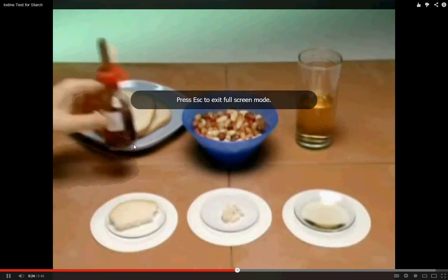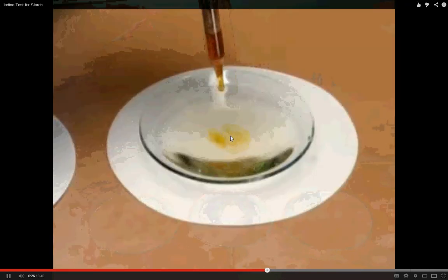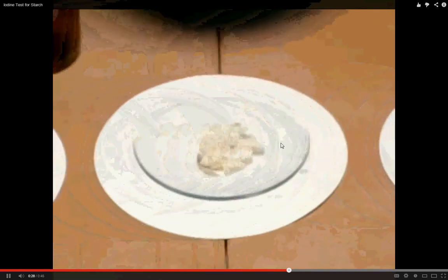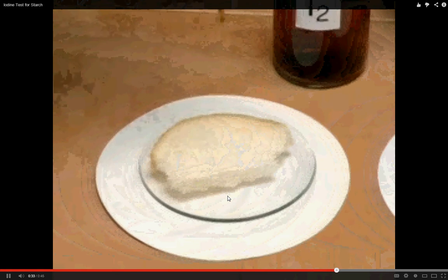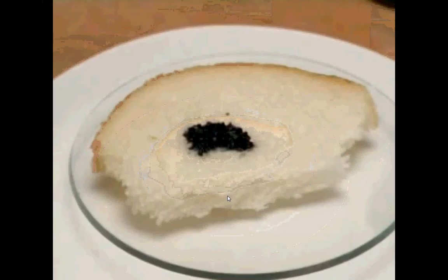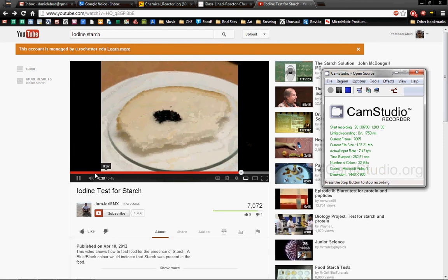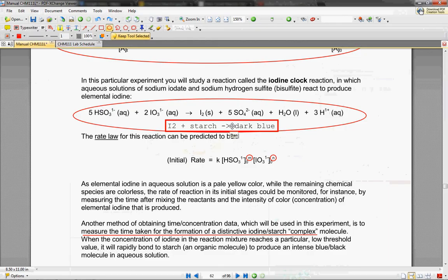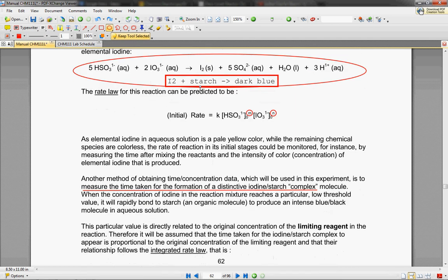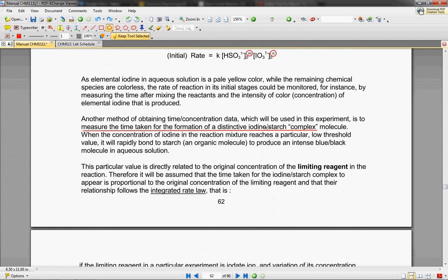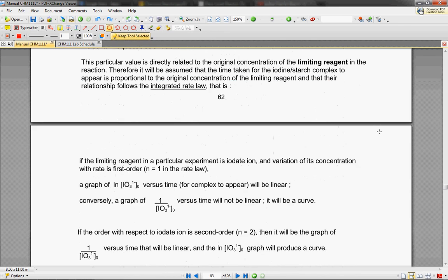I've actually loaded up a little video for you. Here's your iodine, and you've got grape juice - there's no starch in grape juice. You've got nuts - no starch in nuts. And then you've got bread, and we all know that bread has a lot of starch, so you'll notice that the iodine turns a very dark color. That's essentially how we're going to measure our completion. Once we've gotten to completion, we're going to get a very dark color. It's going to be called the iodine starch complex molecule.